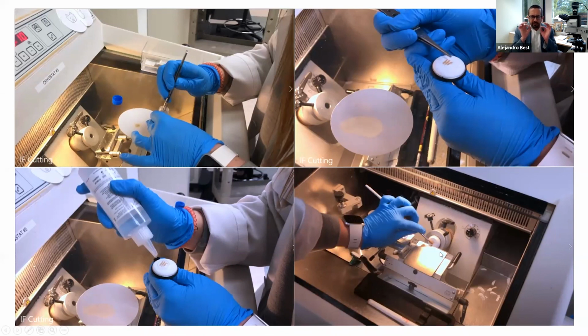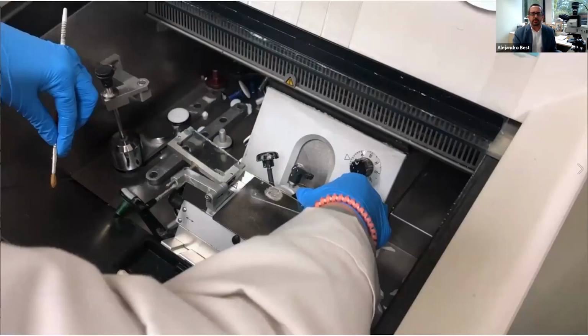Since we're dealing with very, very small pieces of tissue, as soon as we get into the tissue, we start picking up the slides. We can always go deeper, but there's no way to go back and get the tissue that we already lost. So in that sense, we're very cautious with how we use the tissue. When you make your sections, and these are 4-micron sections, you can start picking your slides, and these slides are the ones that will eventually be used for immunofluorescence.